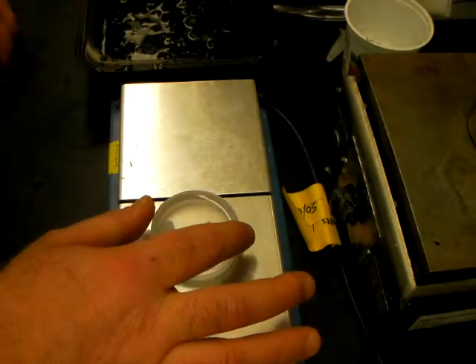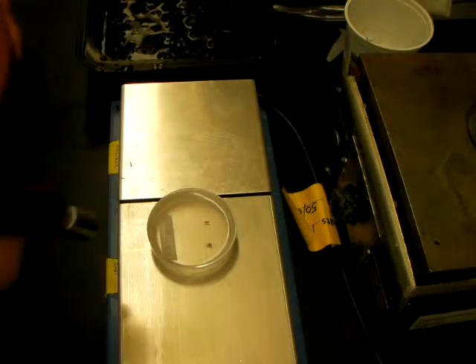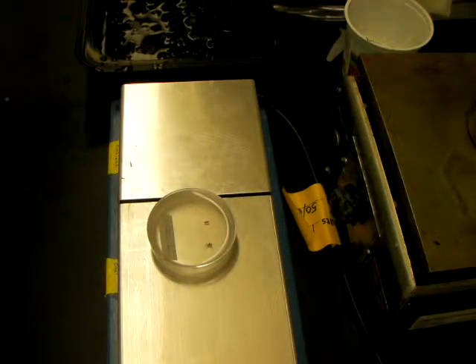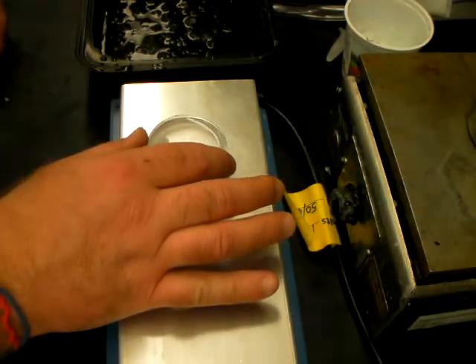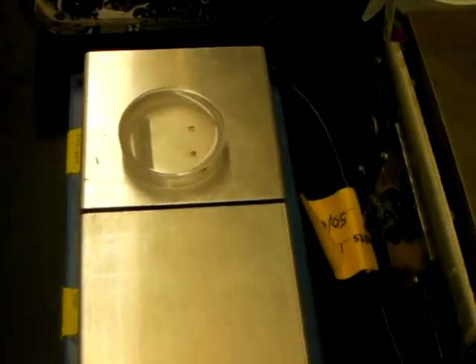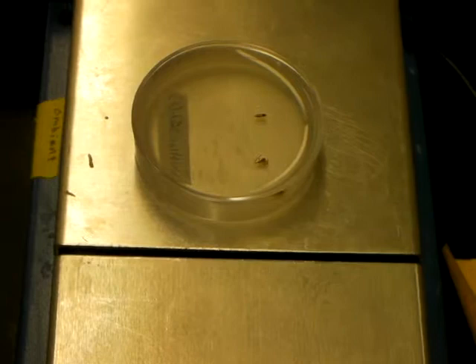We can see here a couple of specimens in the dish. The paraffin is starting to cool on the top and the bottom. It's real important at this point to keep it from cooling on the top. So one thing I'm going to do now is move it on to the ambient portion of the plate. You should be able to see here that it's actually starting to solidify on the bottom.